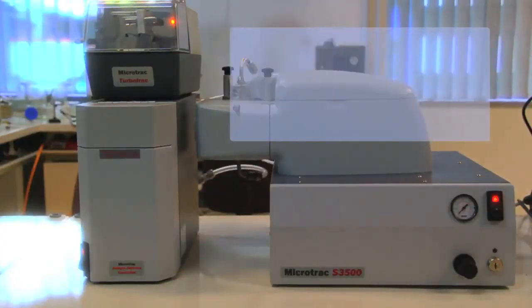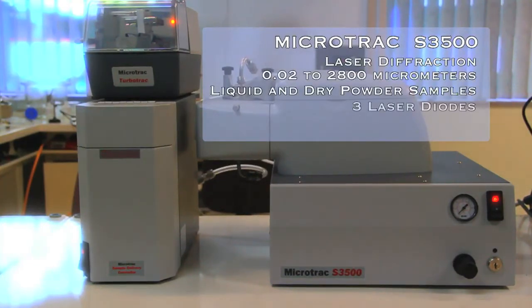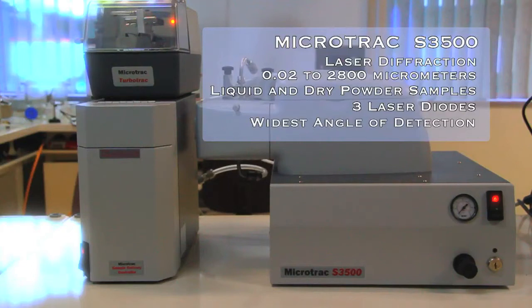The S3500 features a patented tri-laser technology whereby three laser diodes and two detector arrays are used to provide a wide range of angles of detection for unsurpassed resolution.